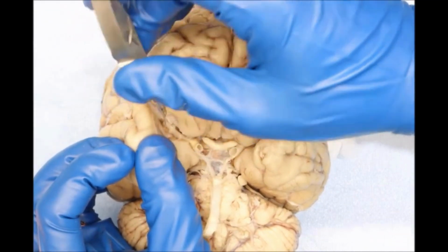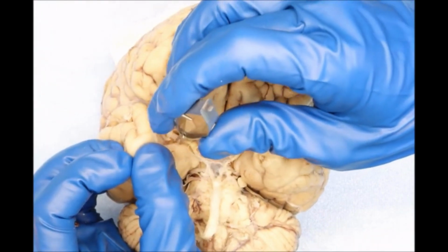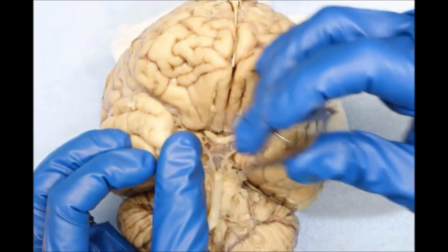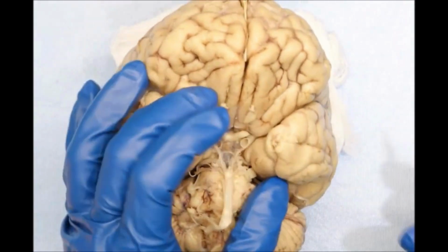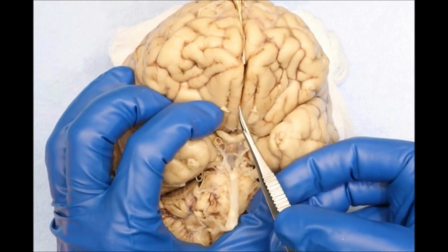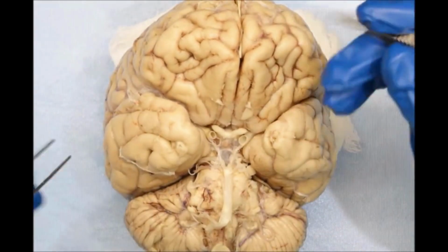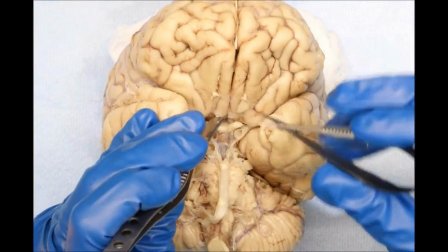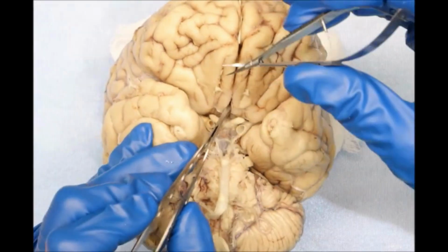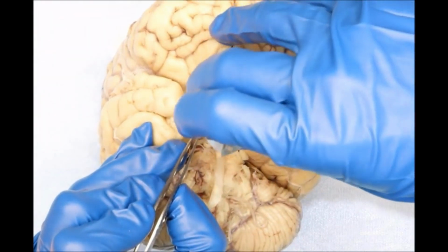Now I'm going to transect the right middle cerebral artery. And now I'm going to work once again in the area of the anterior cerebral arteries and the anterior communicating artery. I'll try to keep it intact and take it along with those arteries in that area.